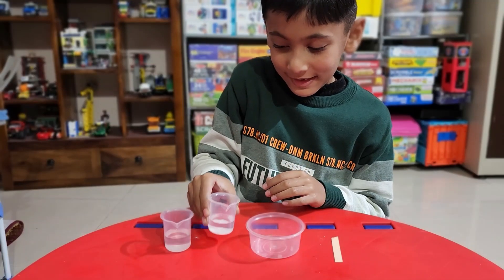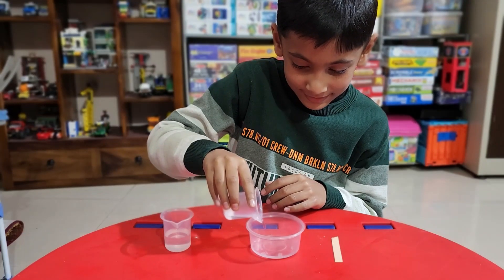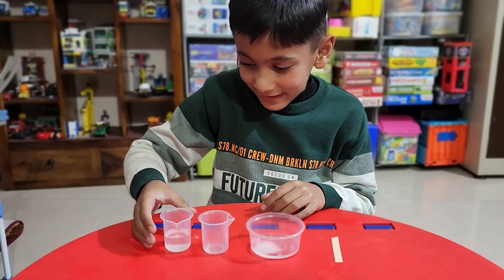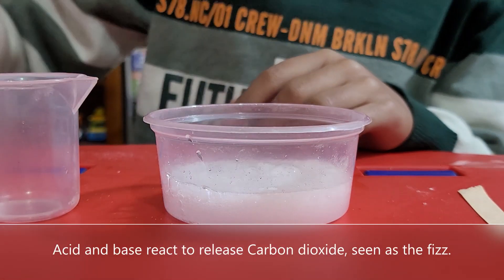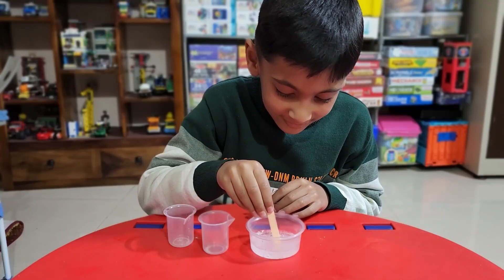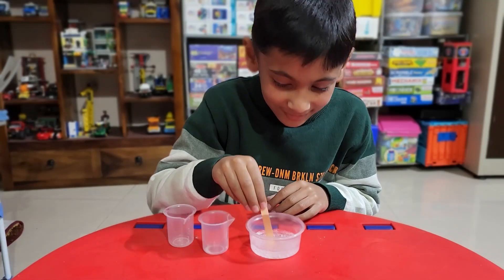In a plastic bowl, add both the citric acid solution and baking soda solution together. Observe what happens when you do this. Now, test the pH of the mixture in the plastic bowl using a pH strip.